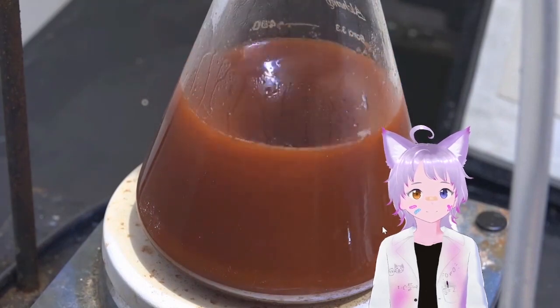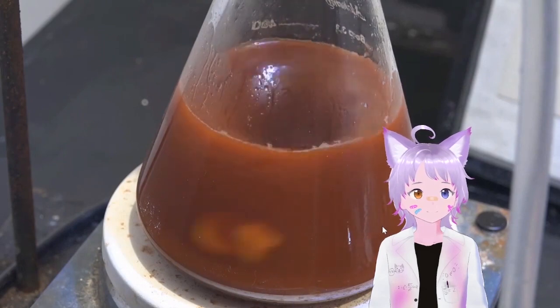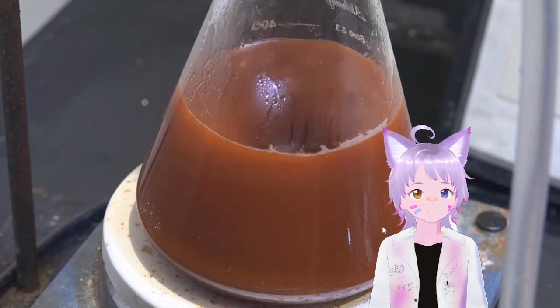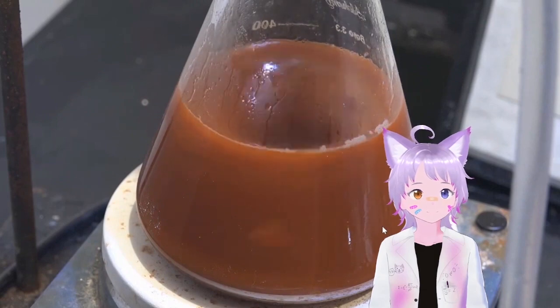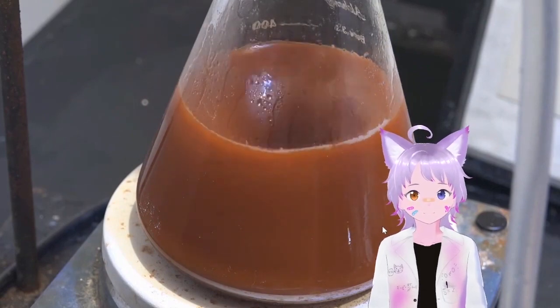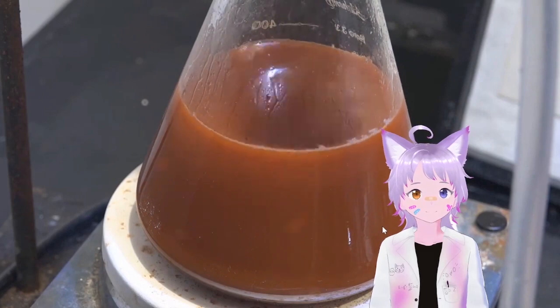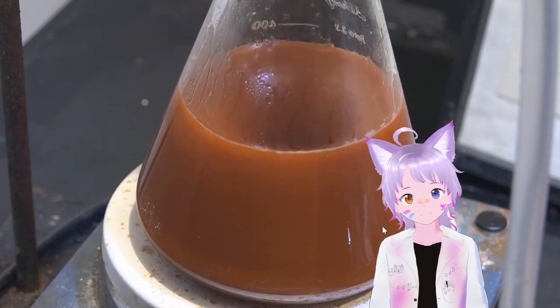It was so much work to make perichlorophenyl acetonitrile, I tried to conserve it by working on a small 300 milligram scale. And for condensation type reactions like this, small scale tends to work against the process. Stray water from the air and walls of the glassware can contaminate the reaction, stopping it working. Scaling up makes the reaction more reliable. This is one of those times in chemistry where size does matter. My performance problems for the past 8 months were because I wasn't large enough.